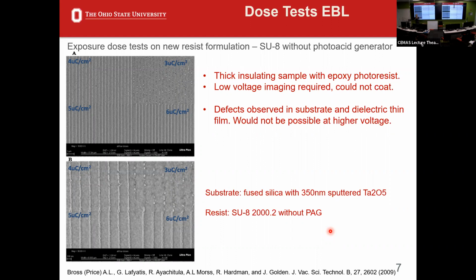In this case, we were not doing lift-off or etching. That was the surface that we were going to care about. We ended up using a slightly different process because this is not super smooth. If you're trying to make gratings, the line edge roughness on these images is pretty bad. It's a good example of SEM, but not a great example of gratings.